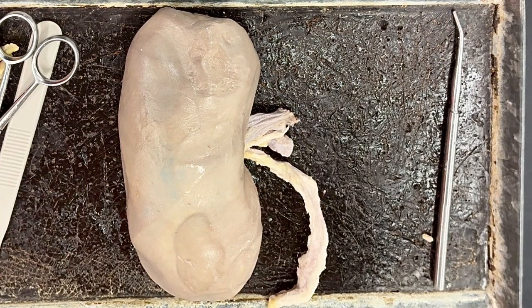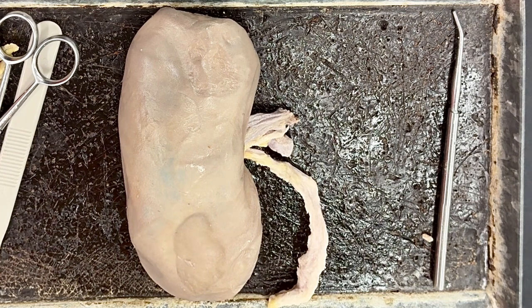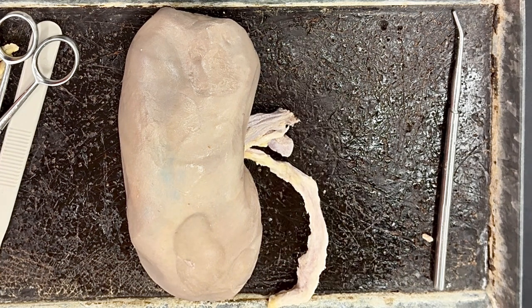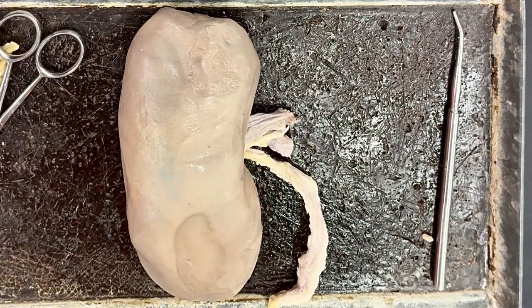In order to get a look at the inside of the kidney, we are going to dissect along a frontal or coronal plane. I'm going to go ahead and make that frontal cut now.